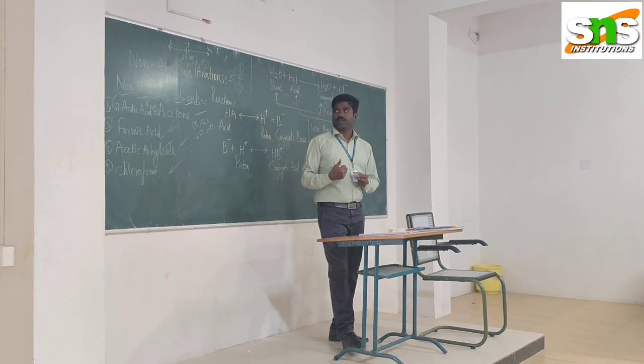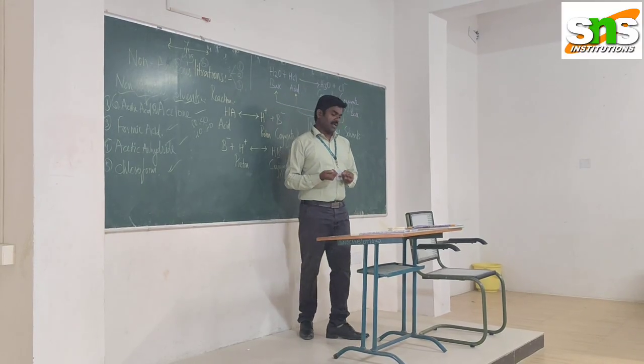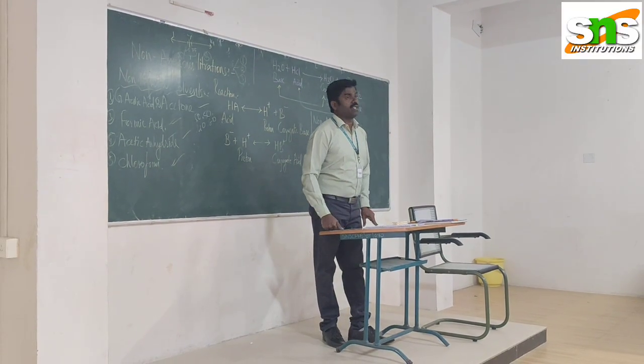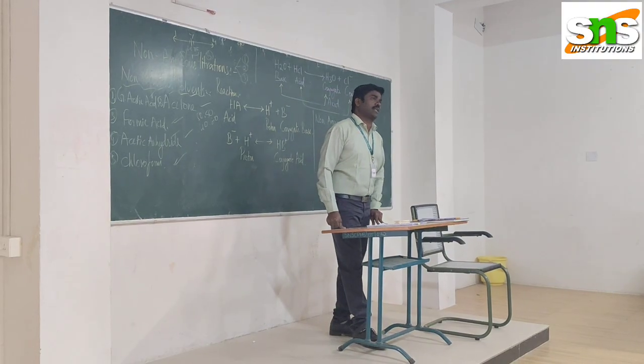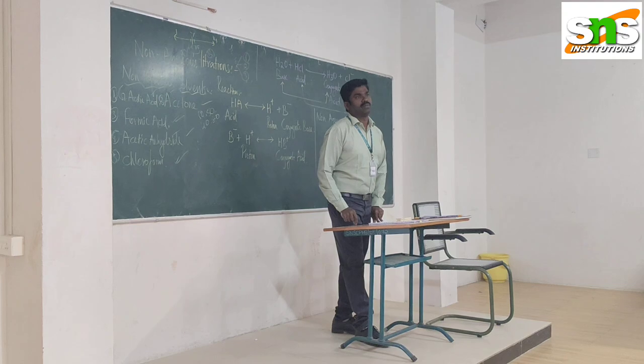So now I am going to explain the principle of non-aqueous titration, followed by the advantages and disadvantages of non-aqueous titrations. I hope this introduction about this non-aqueous titration technique is very useful for these B.Pharm learners.